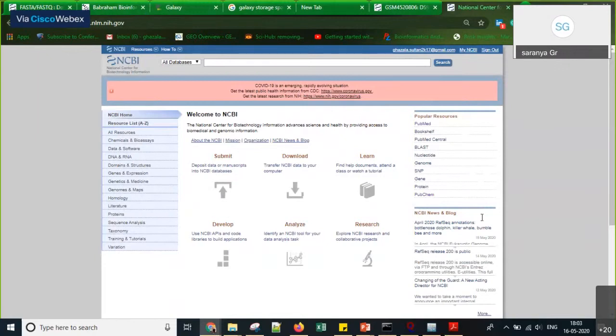Yes, sir. Actually, we processed the sample, sir, and we got the data in CSV file format. We couldn't process the data, whether we want to check with NCBI or something else. It is a basic question I'm asking. What can be done with the data we obtained from the processed sample? They have given the data in a format, for example, reads. So many things they have coded in that file. What are the things that can be done with that, ma'am? Okay. So what kind of processing has been done for the data which you have provided?